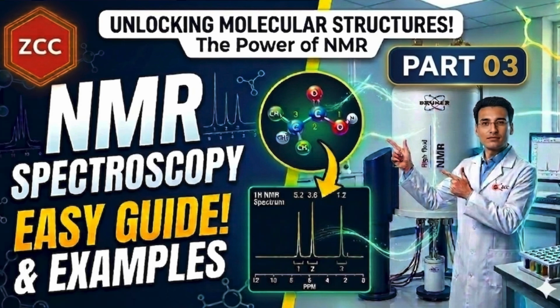So today is part 3 of a lecture series about NMR spectroscopy, and in this particular lecture we will mainly discuss the topic of chemical shift and diamagnetic shielding or diamagnetic anisotropy.